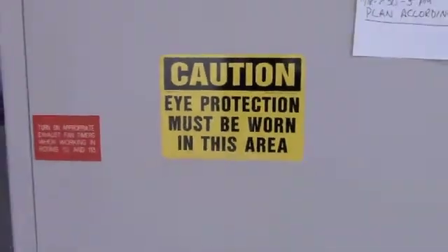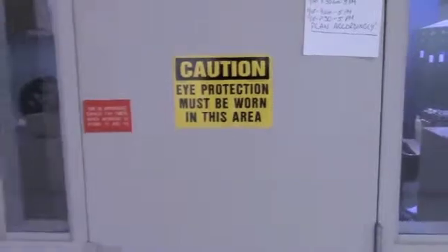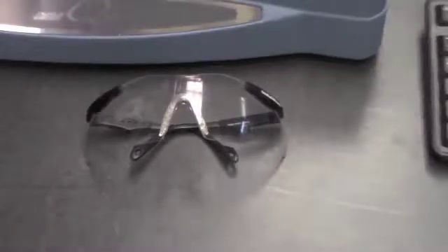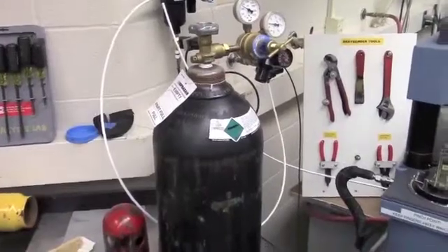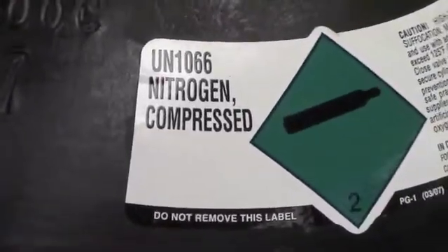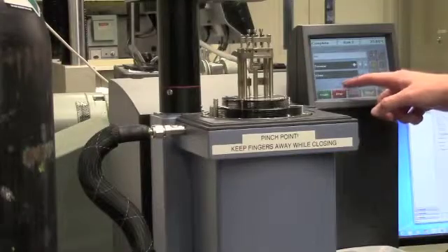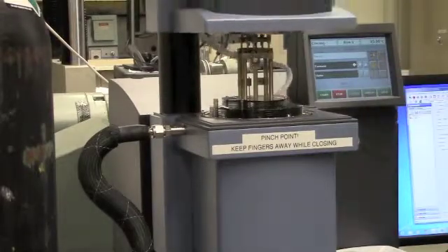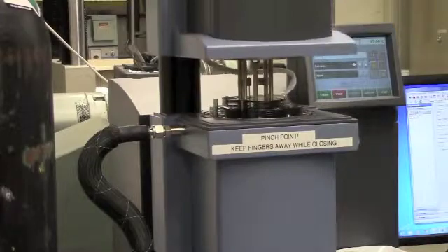There are several safety concerns to consider when using the DMA. Like all labs inside the ETEC building, safety glasses and closed-toed shoes must be worn at all times. In addition, the machine utilizes compressed nitrogen, so care should be taken not to bump the tank or damage it in any way that could cause a leak. Finally, when closing the furnace of the DMA, there is a pinch point that should be avoided.